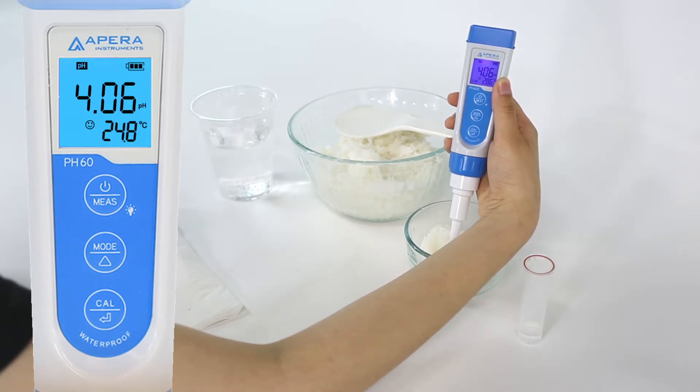If the auto hold function is turned on, you can read the measurement after the hold icon comes up. The hold icon will appear after the measurement is stable for 10 seconds. To cancel the hold, short press the enter button, and then you'll be able to test again.